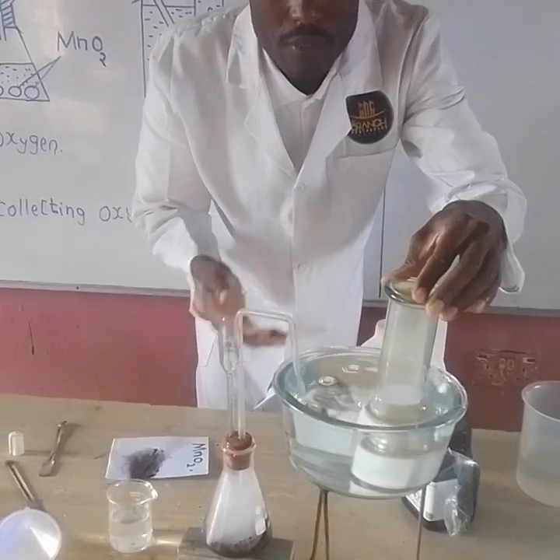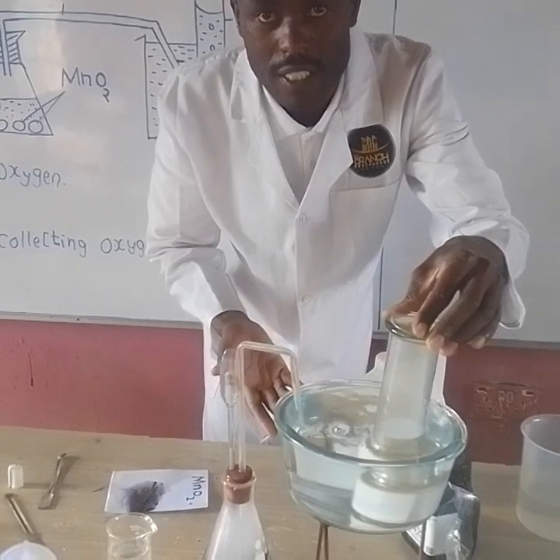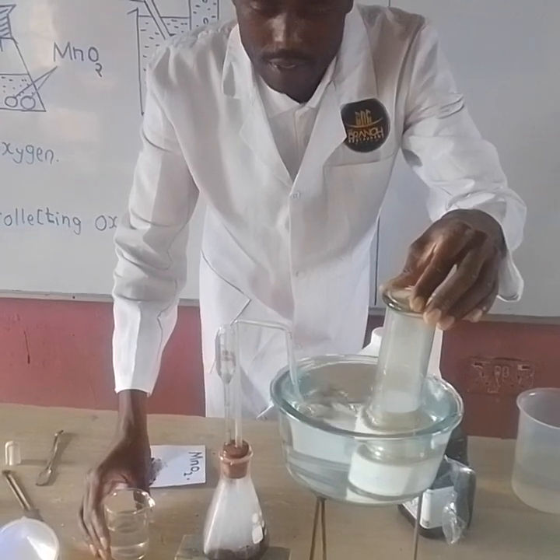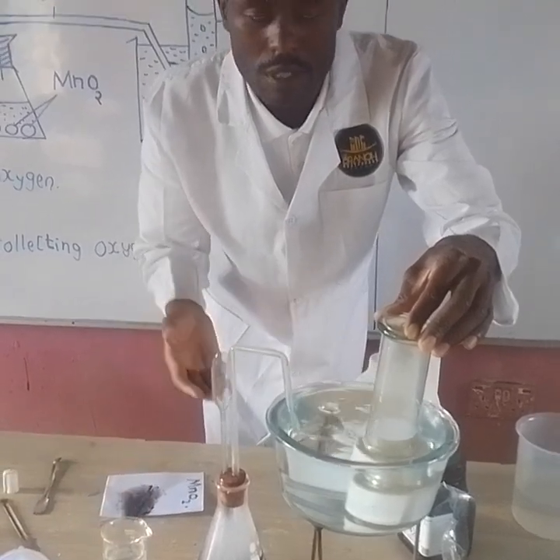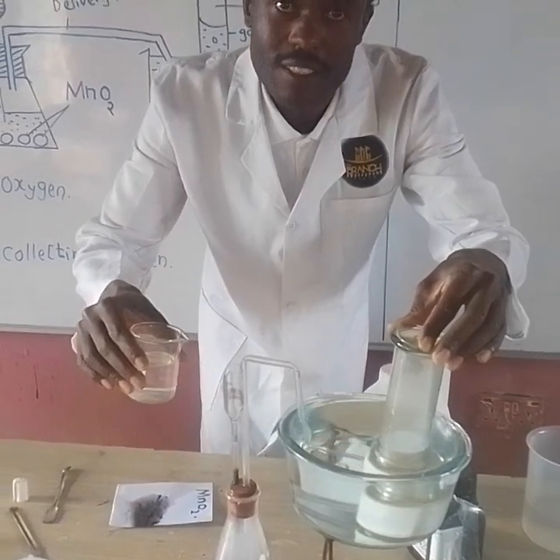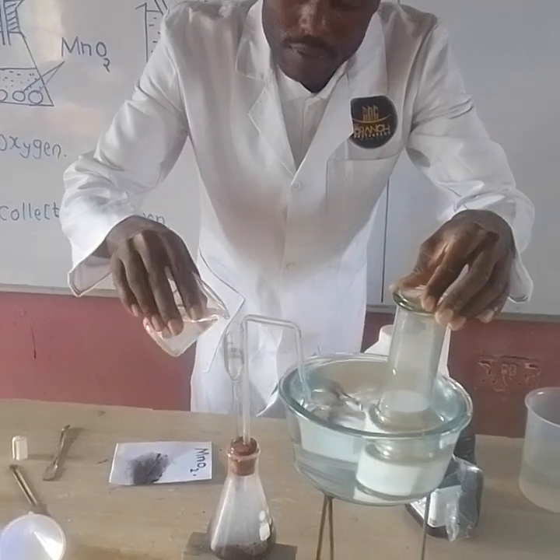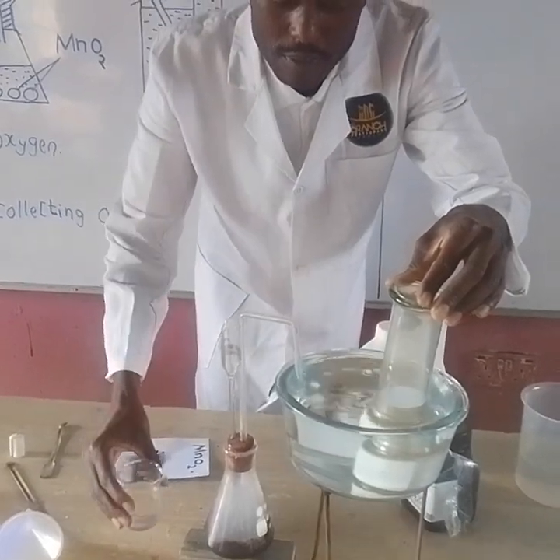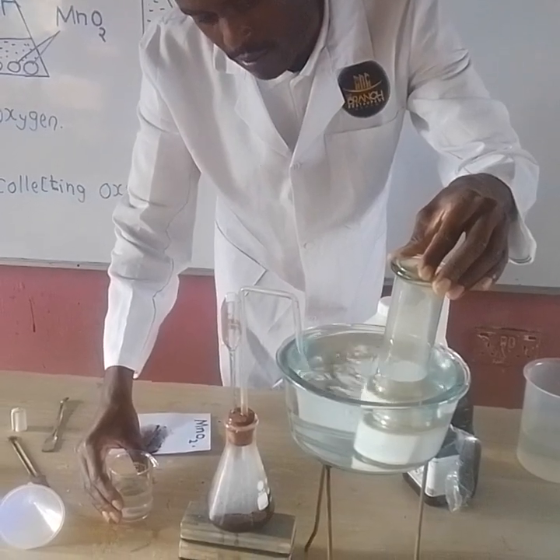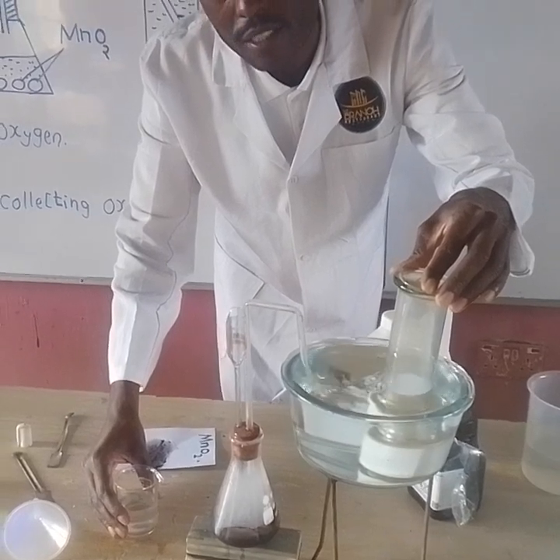This is the simplest way, my student, of preparing oxygen gas. Very simple. What you need to do is just patience. And we have always said, patience pays. And see the gas bubbles.